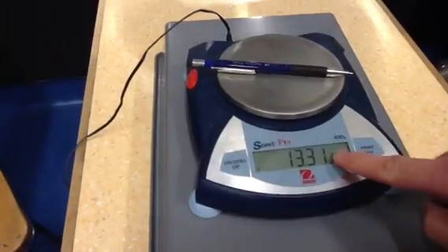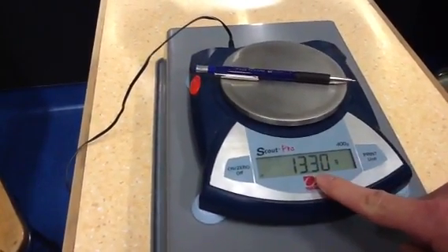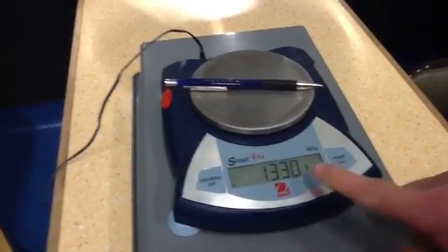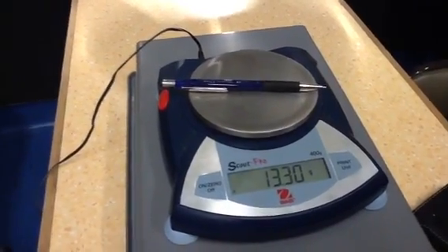If that last digit was still flickering — like going up and down a little bit — I'd just go back and write that the measurement is 13.3 to three significant figures, rather than to four. It seems pretty stable on 13.30, 13.31. I'd be okay with that.